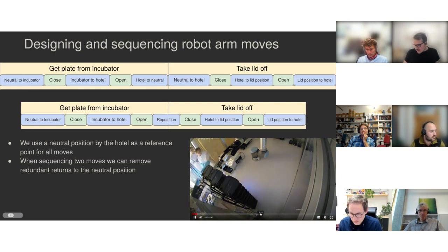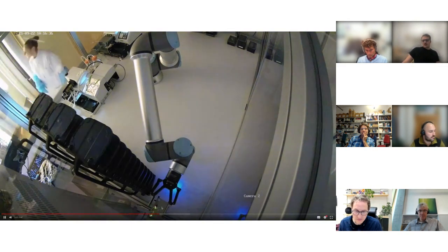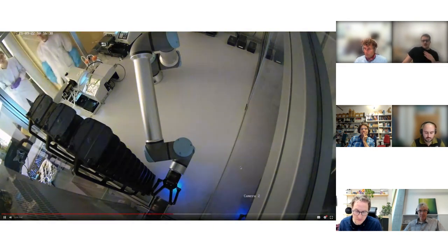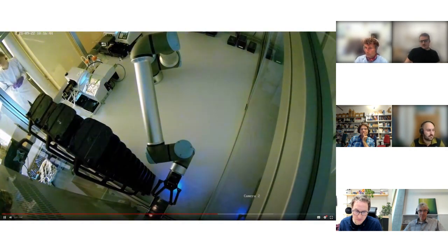So there's a video of this happening here. It takes the plate from the incubator, then puts it on our neutral hotel position, which is the middle of the top ones here.